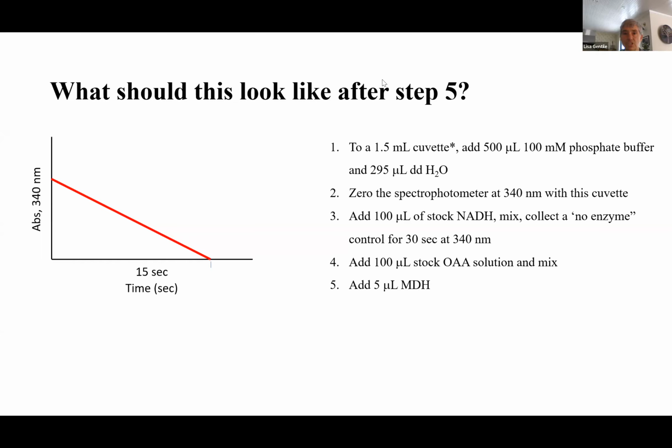Okay, if not, I'm going to stop sharing and let Amy share her screen and jump in. Okay. Yeah, so I'll go to my share, but I was going to give some really general pointers about how to talk to students about doing the calculations and about how we scale to larger things. We talked a lot this summer about the instability of oxaloacetate and how it's really best made up in water, which seems completely unintuitive to me, and using it fresh.